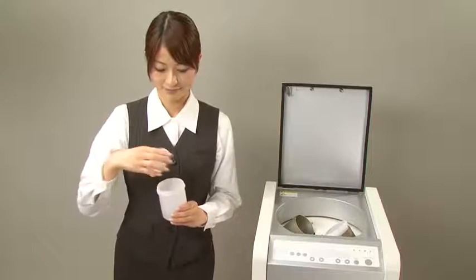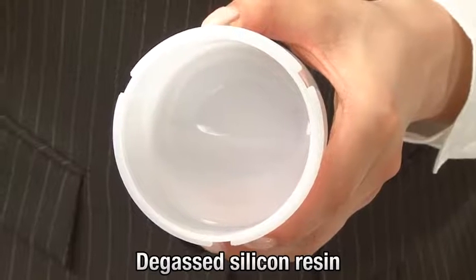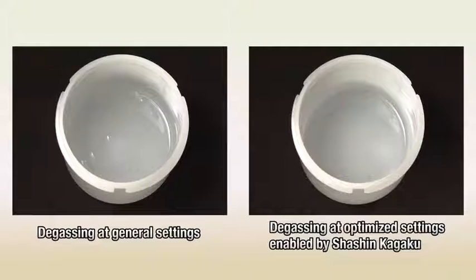See for yourself — the resin has been completely degassed. Because revolution and rotation speeds can be separately set, the unit successfully removes microscopic bubbles.